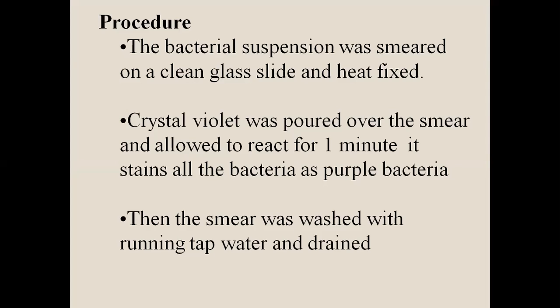You should not heat for a long time. Why? Because if you heat, then the cell wall will break down.